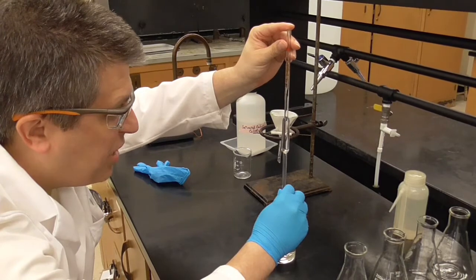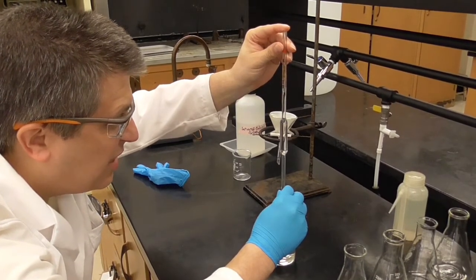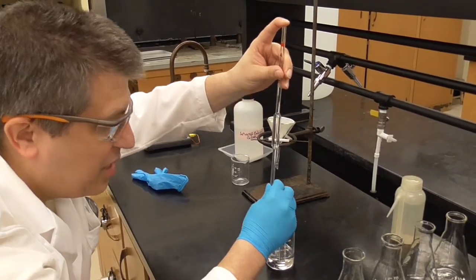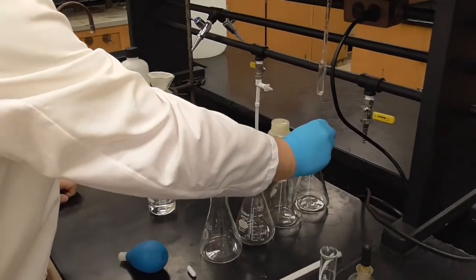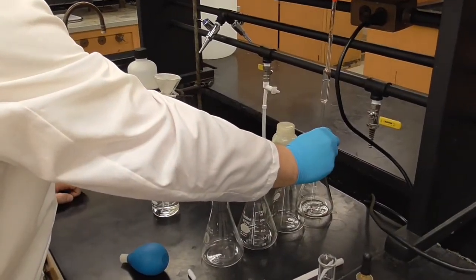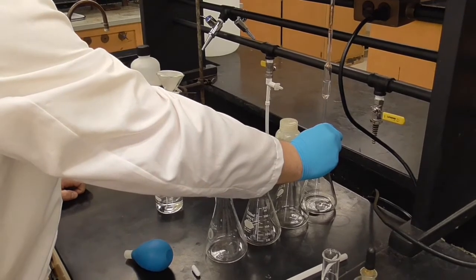Okay, you're probably not going to be able to see the meniscus on the line, but you're just going to have to trust me. And I'm going to put 10 milliliters into each of these 4 Erlenmeyer flasks.